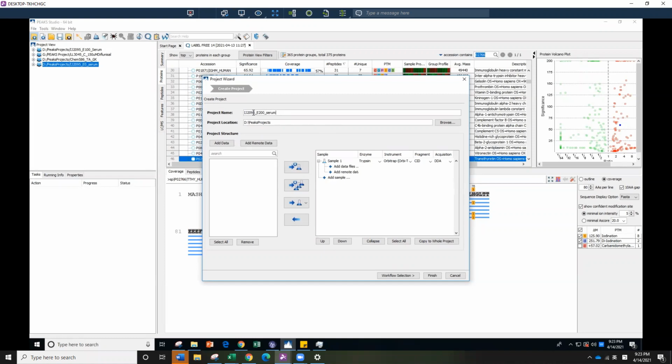So here IJ is Isabella's notebook, and then E200 is EDTA, 200 molar equivalent in serum. So that is something like, if you're on the project, you would know. But having your notebook code in the front of the project name is important. As we mentioned before, notebook code is the key for everything. So it helps you recognize your projects, and also helps people recognize yours.